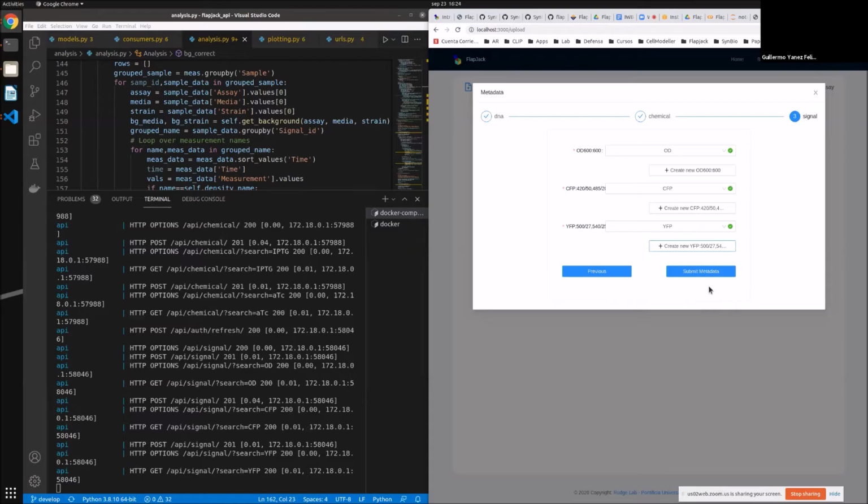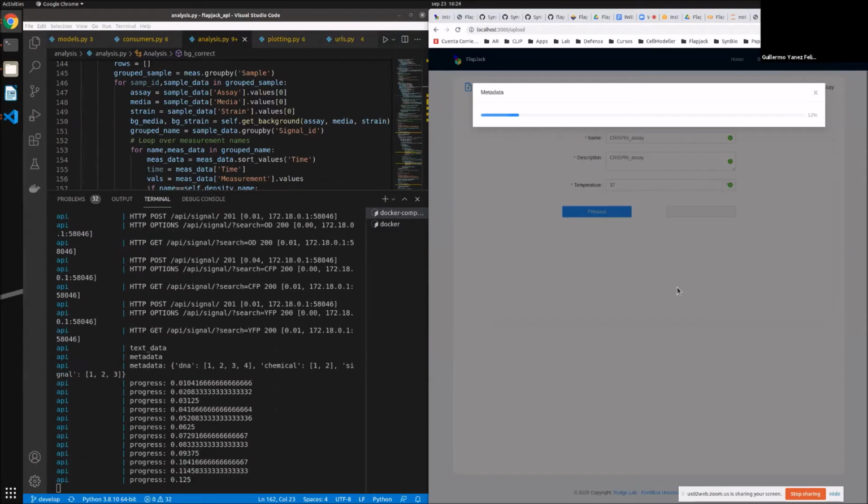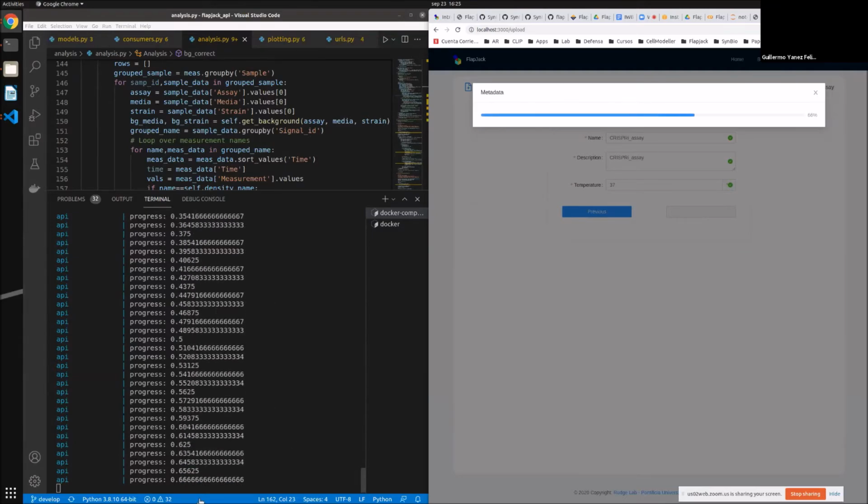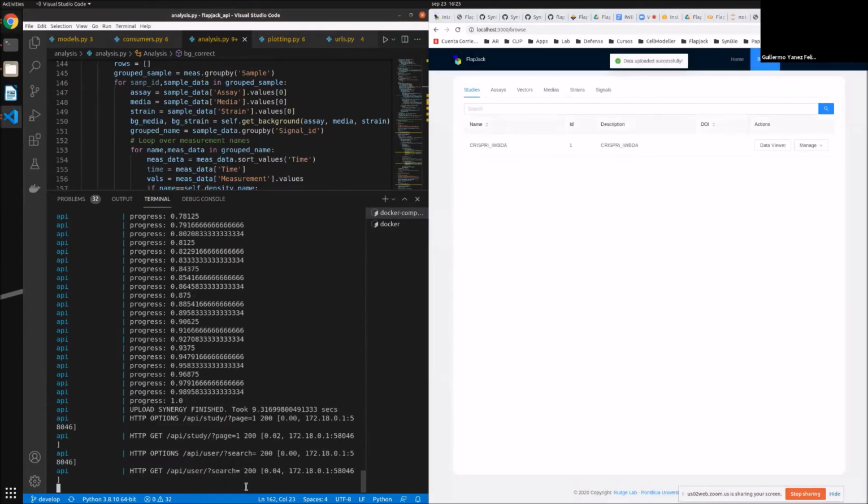In the server, it usually works pretty fast, but as you know, when you want to show something, it works differently. Here I'm seeing the log. I have just this print for ease of information. And that's it, basically, for this part.